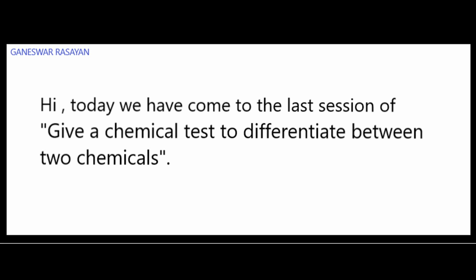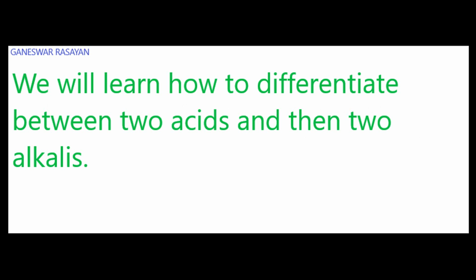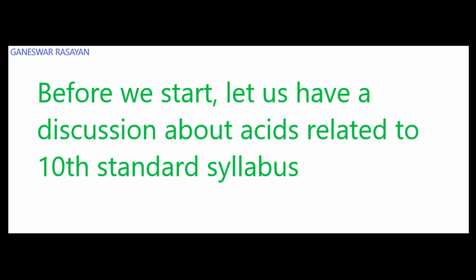Hi, today we have come to the last session of Give a Chemical Test to differentiate between two chemicals. We will learn how to differentiate between two acids and then two alkalis. Before we start, let us have a discussion about acids related to 10th standard syllabus.